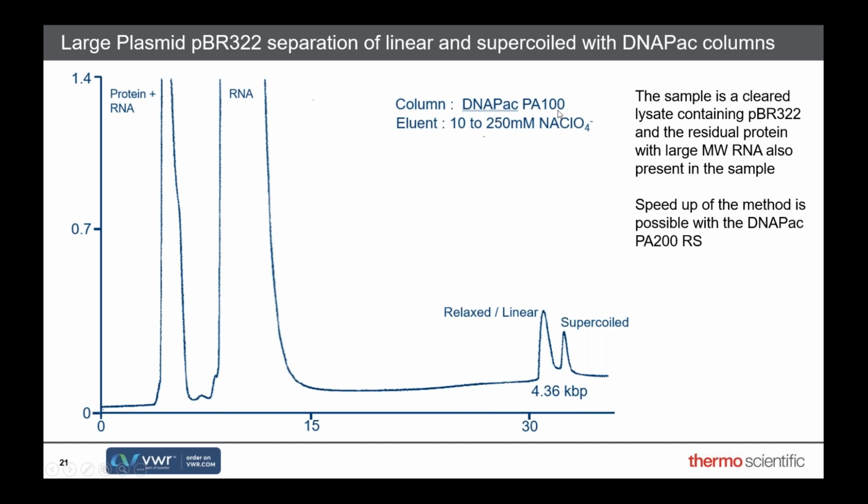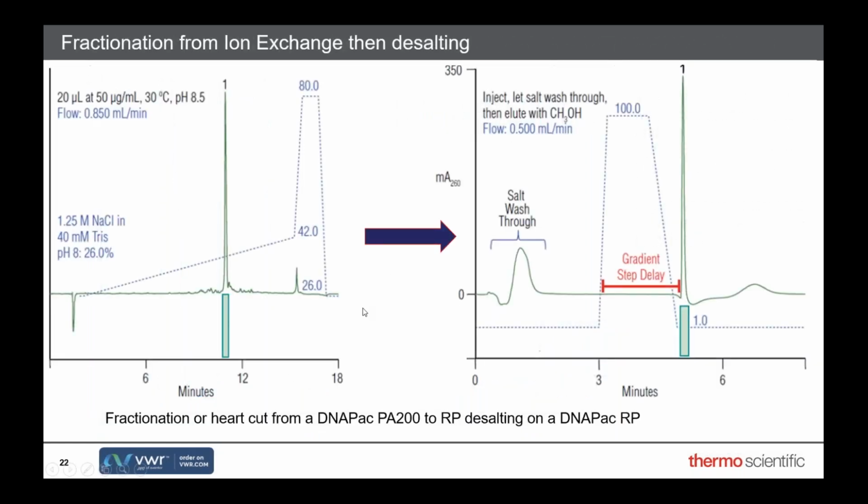This is an old slide. This was done on the PA100. I'd really like to see this done on one of the newer columns, which should be a lot better. So if anyone out there has some samples they'd like to try on this, I'm very keen to have a look and update that slide.